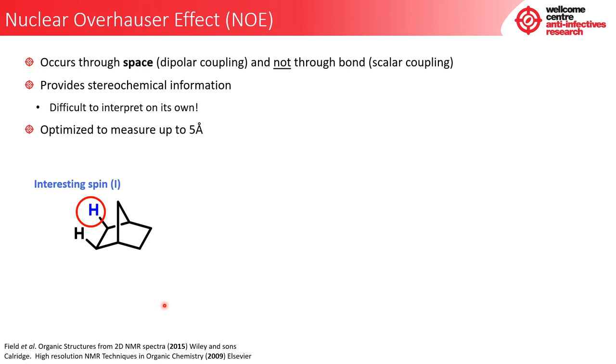So what do we want to start learning about it? Well, we take the source spin, and we irradiate it at its Larmor frequency. And what is the Larmor frequency? In brief, the Larmor frequency is a frequency at which the nuclei will exhibit motion. For the purposes of this talk, I'm not going to go through the Larmor frequency further. It will be mentioned in previous talks, as well as the references outlined at the bottom of this slide.